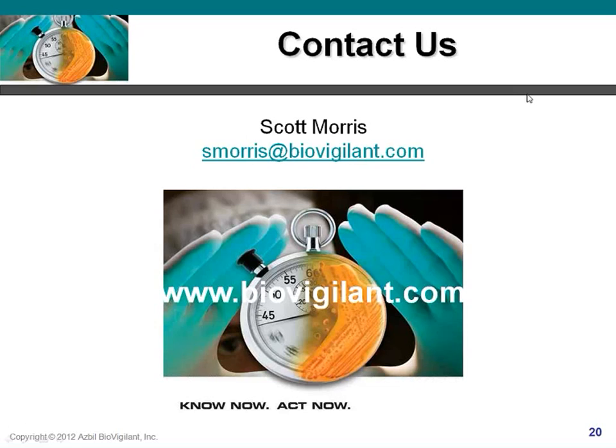That being said, I think what a lot of our customers are interested in is the parametric release that we talked about. And so in parametric release, I believe a sterility test would probably still be part of that process, but the disposition of your batch wouldn't necessarily be on hold while you're waiting for the result of the sterility test, especially if it was a traditional sterility test that required something like 2 weeks. With parametric release, even though you're still taking a sterility test, if all of your other data, which could include data from the IMDA system, says that your environment was under control, that would give you the confidence and the support, the justification to release the batch with the knowledge of extremely high probability that your sterility test is going to come back clear.